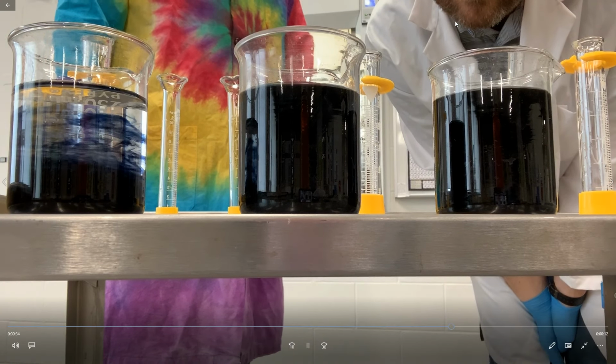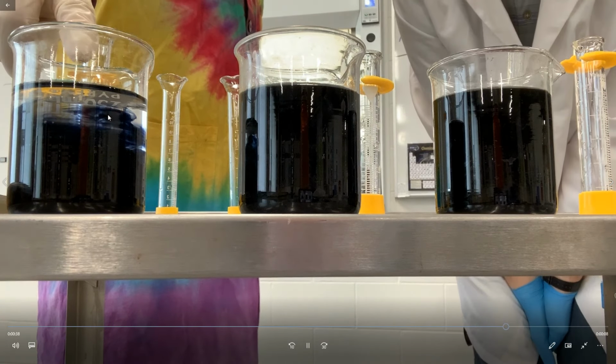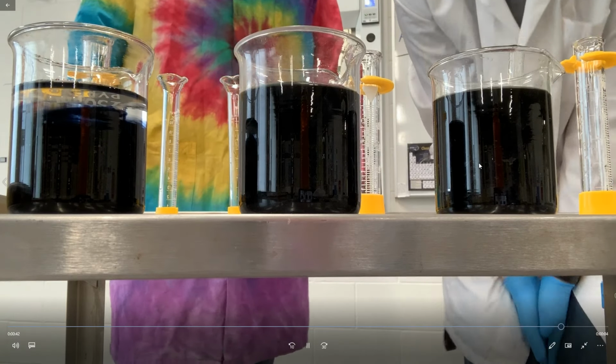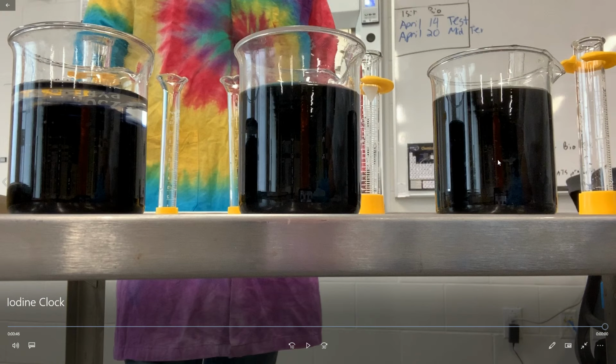See Mr. Shred's glorious chin. There you go. 5, 10, 15 milliliters. So you see this one, even though we added it later, still finished first. It was real fast. This one, even though we added it at the same time as this one, took a little while, but it reacted at a decent rate. This one took a long time to actually work its way through.